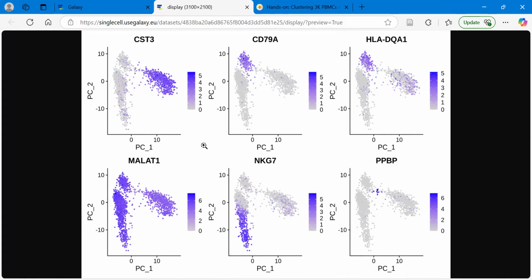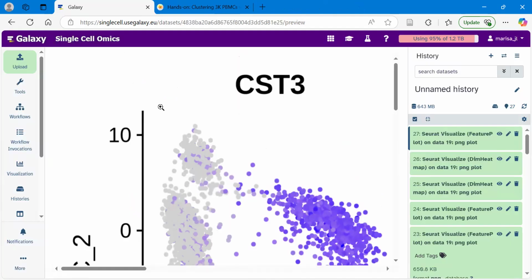So those 2 are the ones associated with PC1. I think that's a slightly clearer arrangement of them, which is why the tutorial advises you to change it to be in 3 columns, but it's still the same plots. So we've looked at the two sets of feature plots there.